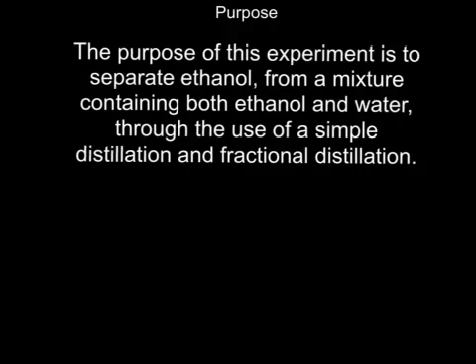The purpose for this experiment is to separate ethanol from a mixture containing both ethanol and water through the use of a simple distillation and fractional distillation.